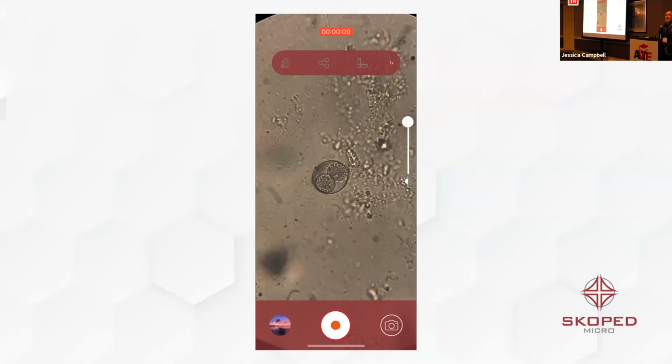Oh, okay. So what do you have, an iPhone? Okay. So you've had a recent update. We'll touch on that. Some of the newest updates have put in some protective things, and we're trying to work around that. Some of you probably can have it, some of you won't.